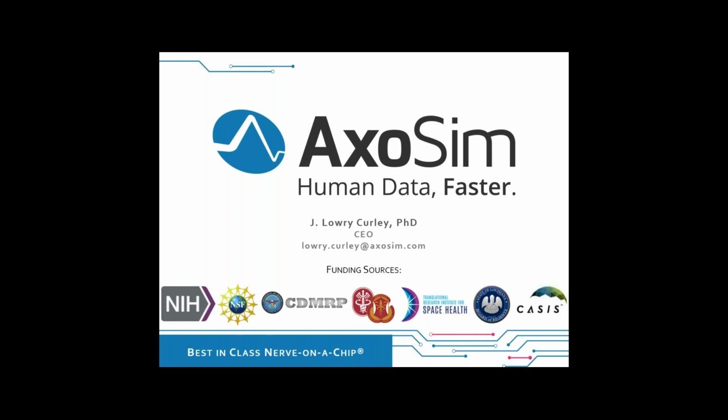It's hard to get above 96 wells. And some systems, if you want to build in a lot of complexity, we're working even towards that. So there are challenges, but we've made a ton of progress, and frankly, the challenges are kind of fun to work through. Mm-hmm. Another question, is there any difference between mini brains and NPC neurospheres?